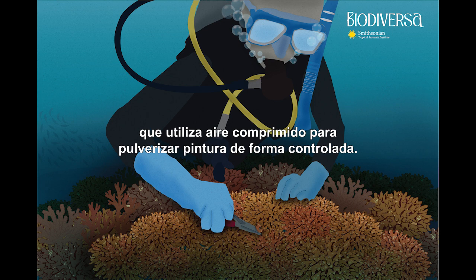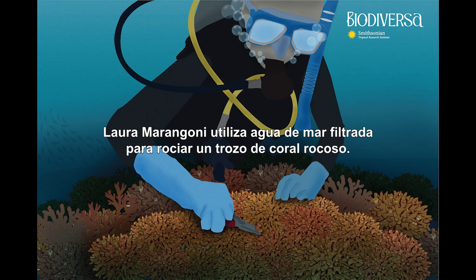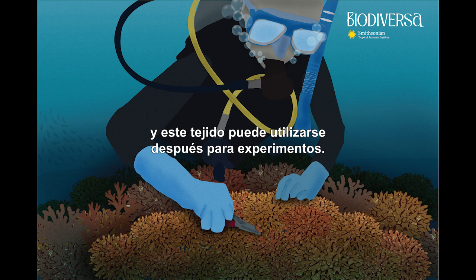An airbrush is a tool that uses compressed air to spray paint in a controlled manner. It is usually employed by artists, however you just heard a scientific adaptation of it. Instead of paint, Laura Marangoni is using filtered sea water to spray a piece of stony coral. The water pressure helps remove the coral tissue from the hard coral skeleton, and this tissue can then be used for experiments.